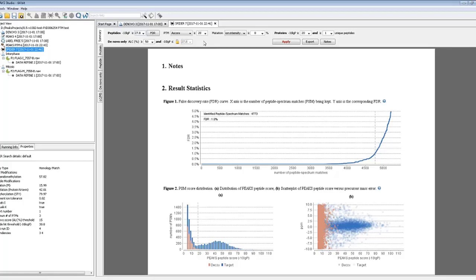To give you an idea of what the A score is, it's a score that calculates the likelihood that a PTM is occurring at the position that's reported in comparison to the other possibilities. It is also a -10 log of a p-value, similar to our identification result, meaning that a score of 20 is equal to a p-value of 0.01 or less. So that's a less than 1% chance that the PTM is being assigned to that position by random chance.